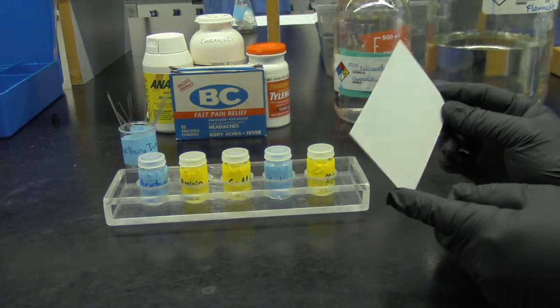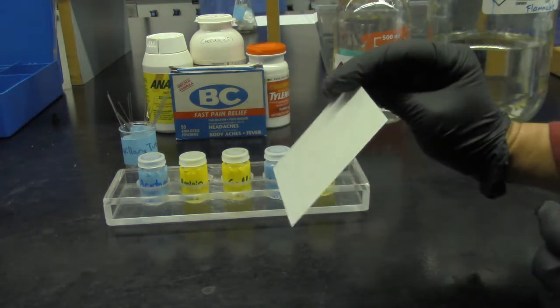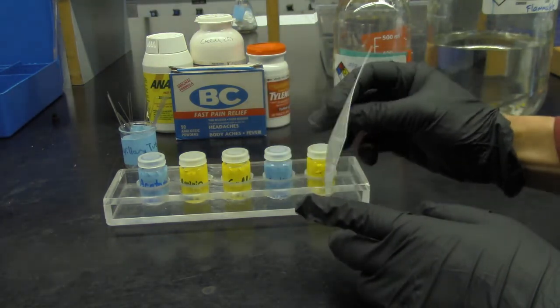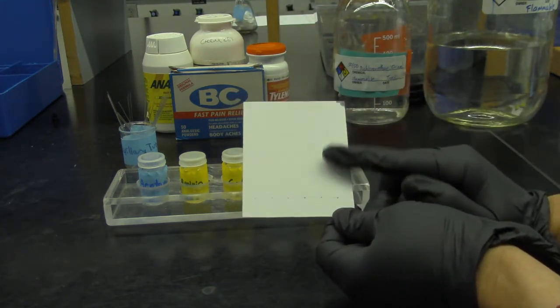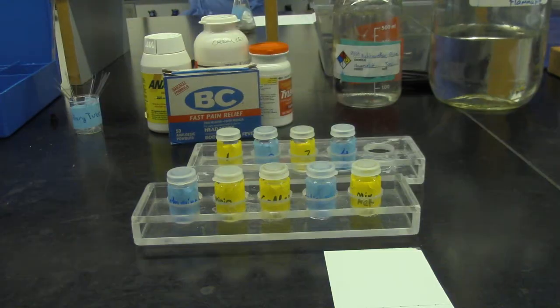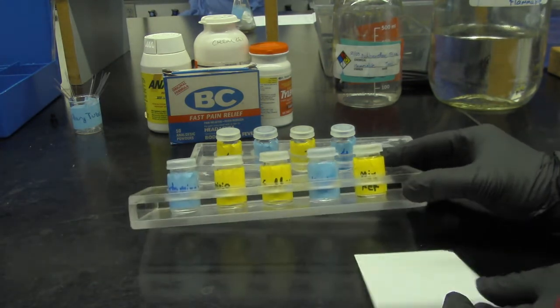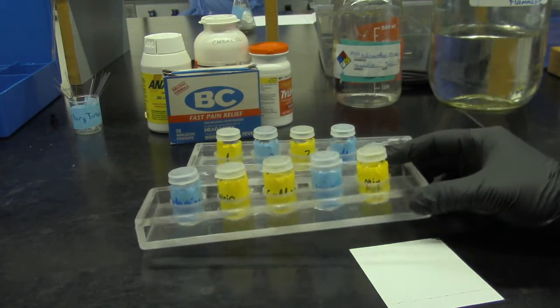It is basically a plate made of either plastic, in this case plastic, or glass, a thin piece of glass, and one side of the plate is coated with a thin layer of silicon dioxide, right? Using this technique, we are going to analyze how different compounds can separate according to their polarity.